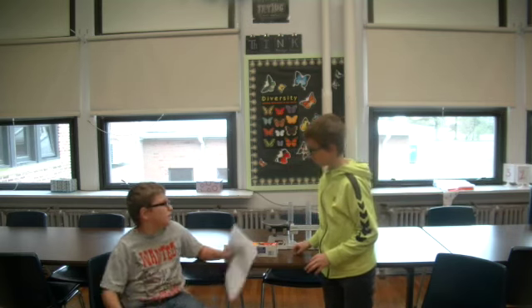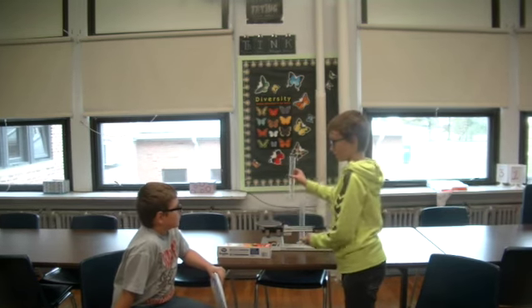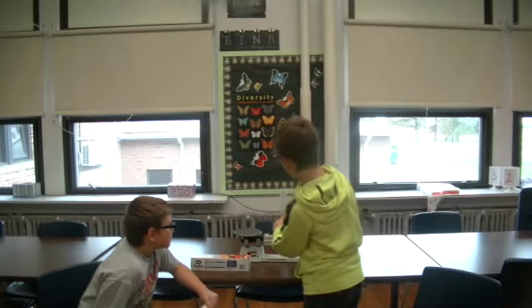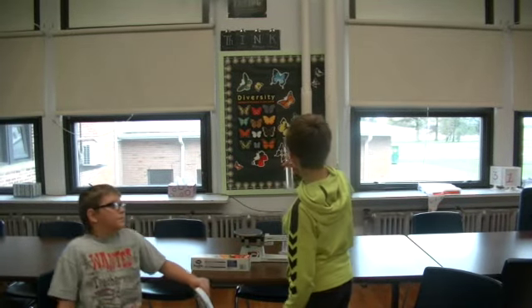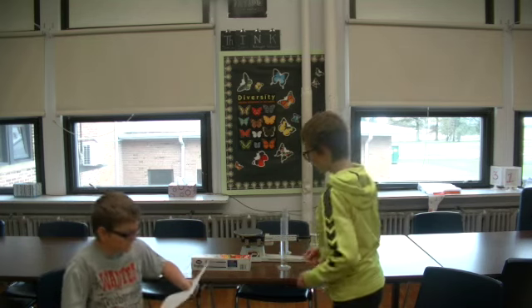Okay, so what's the displacement method? Okay, so the displacement method is where you have a graduated cylinder. So first you want to see how much water is in there. Looks like there is 69 milliliters of water. You want to write that down? Sure.